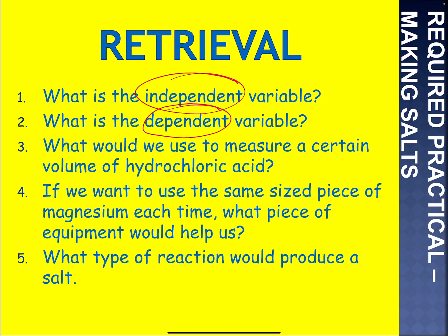Number 3 is a typical GCSE question. What would you use to measure a certain volume of hydrochloric acid? What piece of apparatus do we use to measure volumes of any liquid? Well, I hope you've got a measuring cylinder.